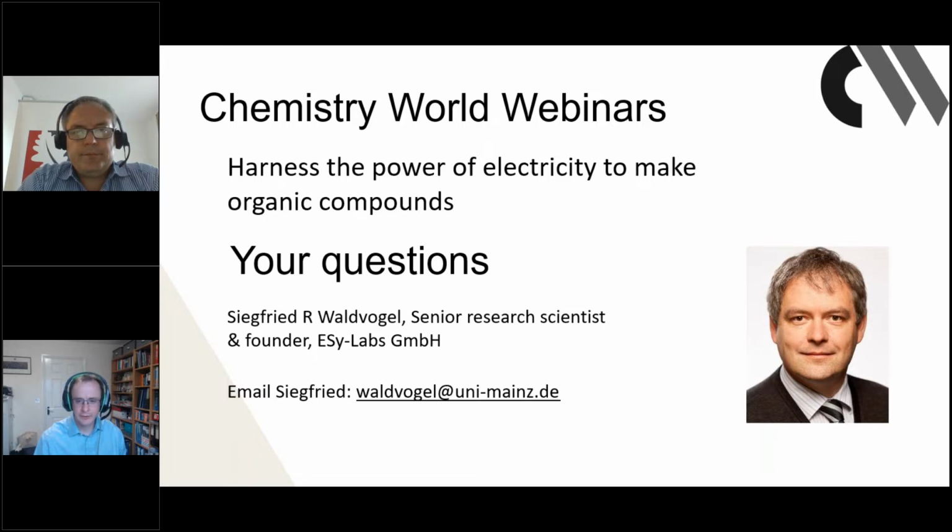I guess it's a difficult question to answer specifically, but there are presumably about as many ways of cleaning electrodes as there are electrode designs. So working out what's right for your particular combination is going to be important. Let's have a look.